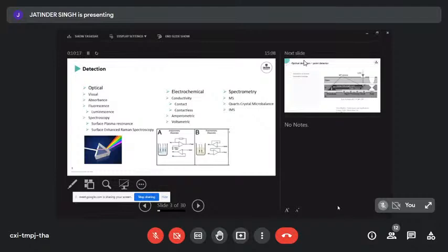And then there are the real electrochemical detections, where we can do amperometric or voltammetric detection by applying a potential difference or current to an electrode set relative to a reference, and measuring the oxidation or reduction reactions going on in the presence of our analytes. And then we've got our special kettle of fish that we've already looked into, where we can do mass spec combined with a chip. There are quartz crystal microbalances, and there's ion mobility spectroscopy that we can do in combination with chips as well.